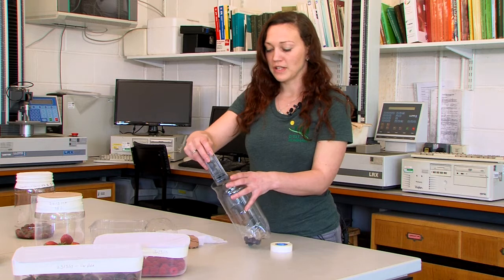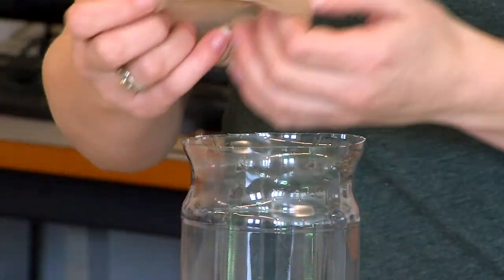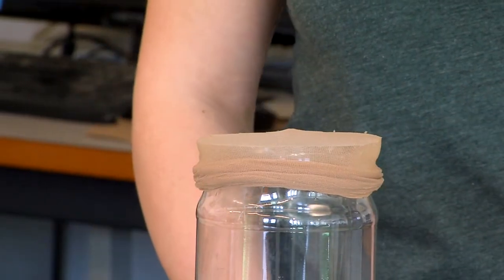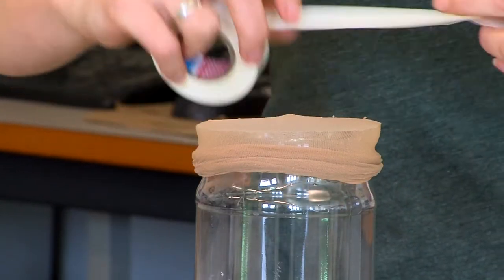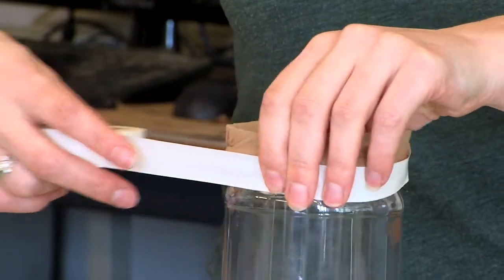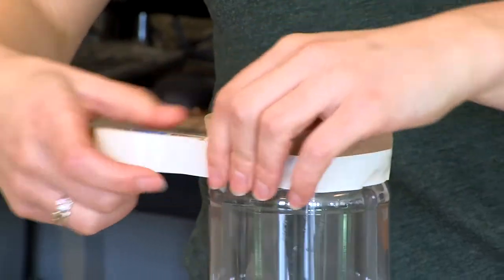Put the fruit into the container and put your mesh across the top. Use the electrical tape to attach it to the container and make sure that it's sealed so there are no gaps that any emerging SWD can escape from.